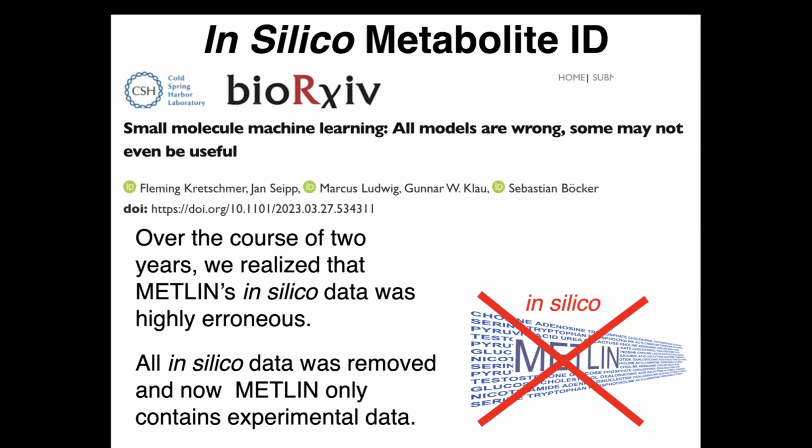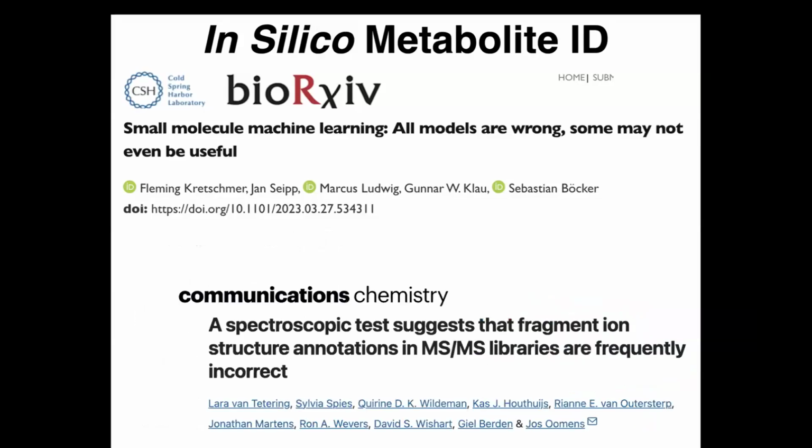it gives you a sense that at this current time, we're really challenged by using machine learning to identify these molecules. And this year, again, a lab that I highly respect, and probably the most cited lab in the world right now with respect to metabolomics, is David Wishart's, and he's a renowned computational chemist.